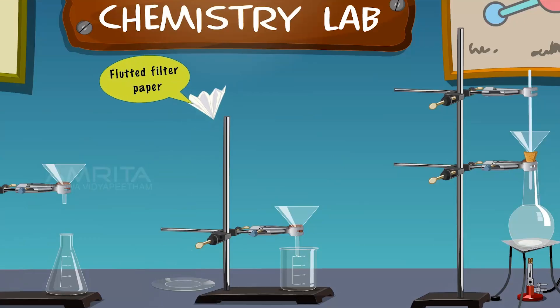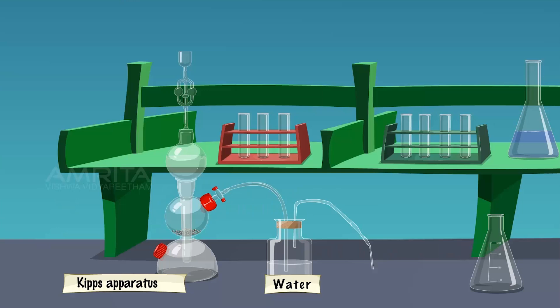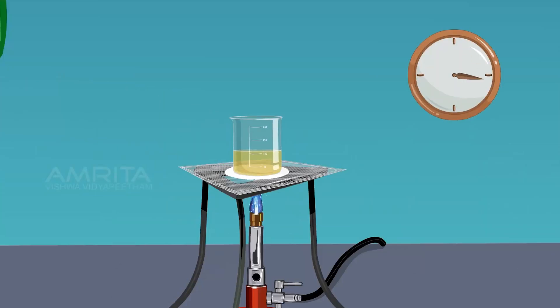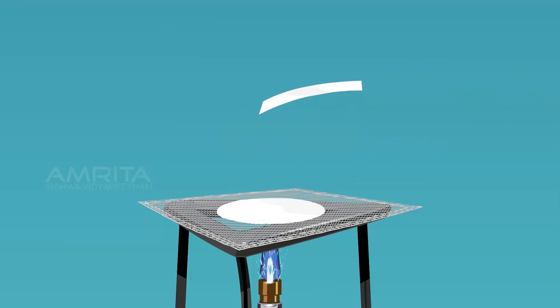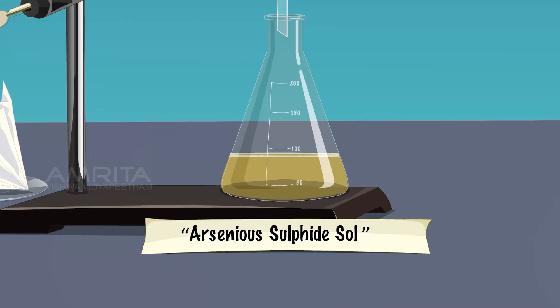Fix a fluted filter paper in a funnel and place a glass rod over the funnel. Filter the hot solution through the fluted filter paper and collect the filtrate in another beaker. Pass a slow current of hydrogen sulphide gas into the solution of arsenious acid. Arsenious acid reacts with hydrogen sulphide to form yellow-coloured arsenious sulphide. Continue passing hydrogen sulphide gas until the intensity of colour does not change further. Expel excess hydrogen sulphide gas from the sol by boiling until the escaping gas does not turn lead acetate paper black. Filter the solution through the fluted filter paper, collect the bright yellow filtrate in a dry conical flask, cork it, and label it as arsenious sulphide sol.